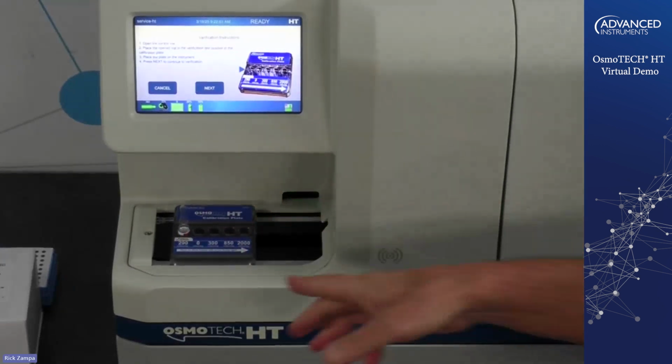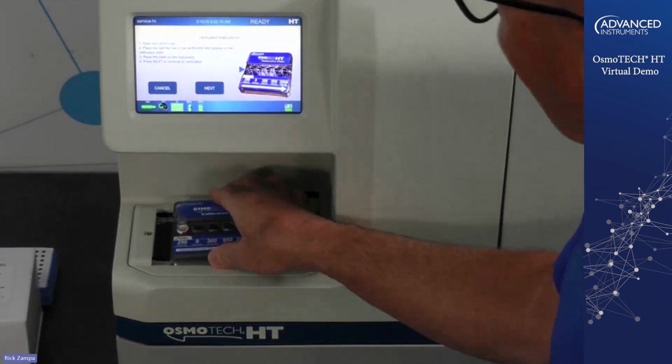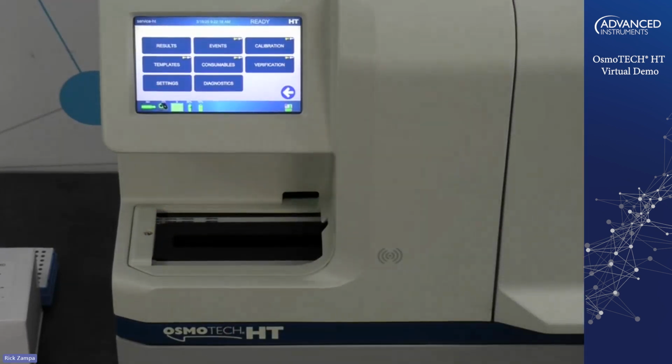It would go through, it would draw up 5 replicates of the verification standard, and then it would run the statistics for you to show you that the sample was within range of the operating parameters of the system. I'm not going to run that right now, but that's how you would run a verification if you wanted to run a verification on the system.